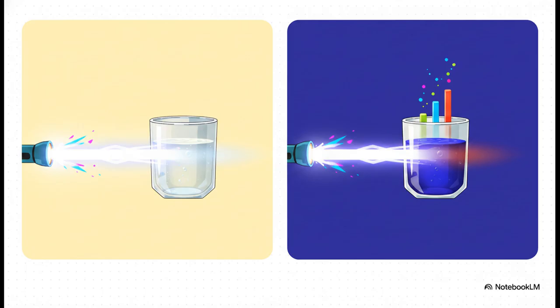Now, how do we actually measure all this? Well, when we place a sample into our instrument, it detects transmittance. That's simply the percentage of light that successfully passes straight through the sample without being absorbed. But transmittance isn't perfectly linear with concentration, so we do a little math and convert it into absorbance. By using the famous Beer-Lambert Law, which relates absorbance directly to the path length and the molar absorptivity, we can quantitatively determine the exact concentration of our mystery sample.